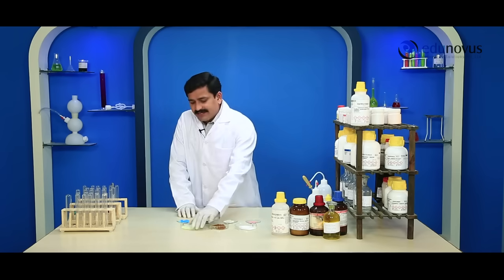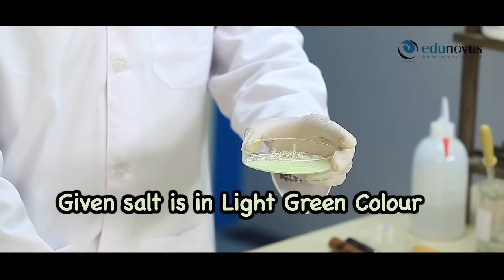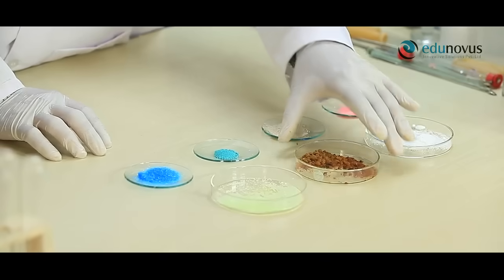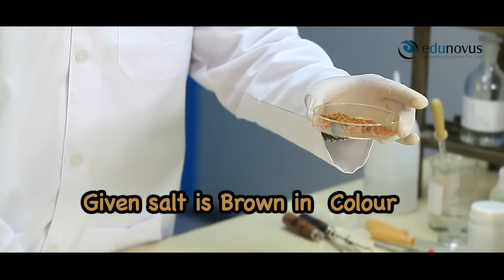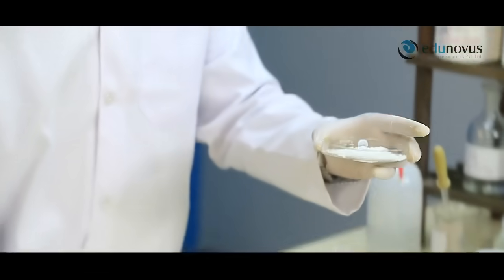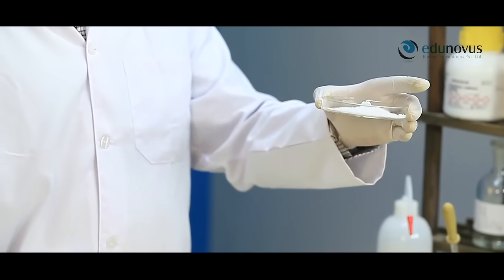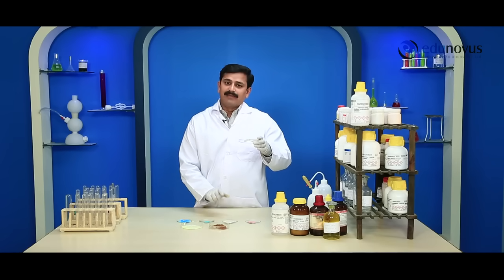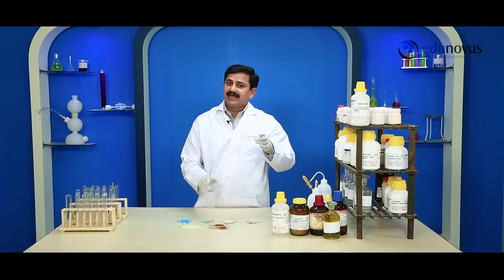If the given salt is in light green color, it may be a ferrous salt. And if the given salt is in brown color, it may be a ferric salt. Finally, if the given salt is in white color, it indicates the absence of colored radicals, namely copper, nickel, manganese, cobalt, ferrous and ferric.